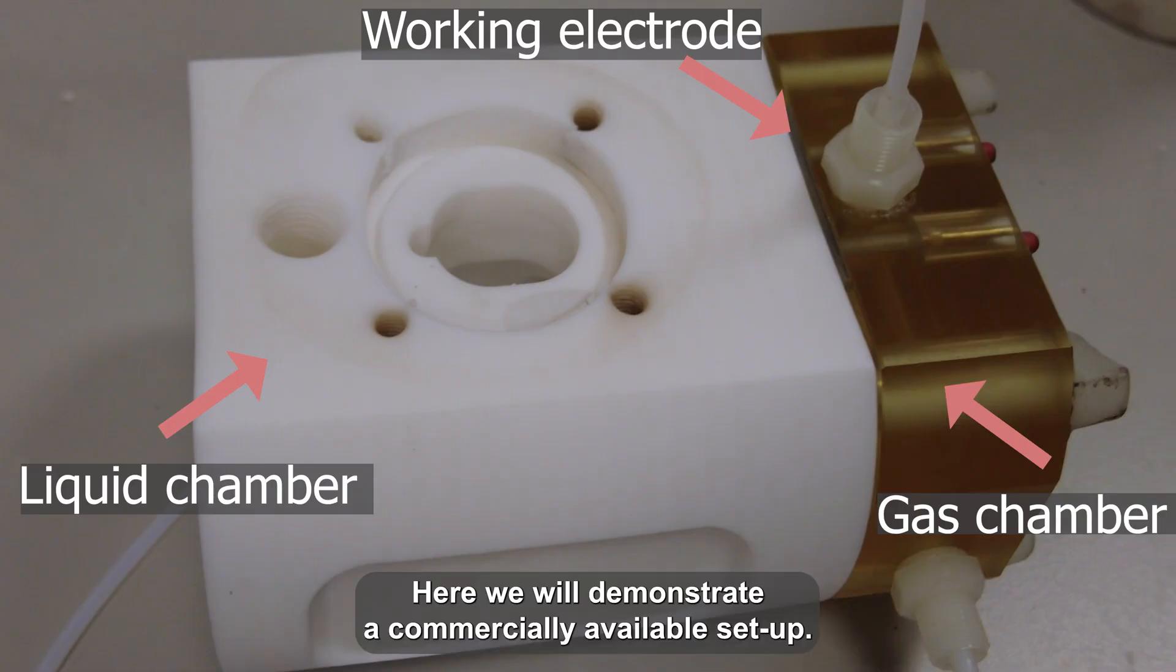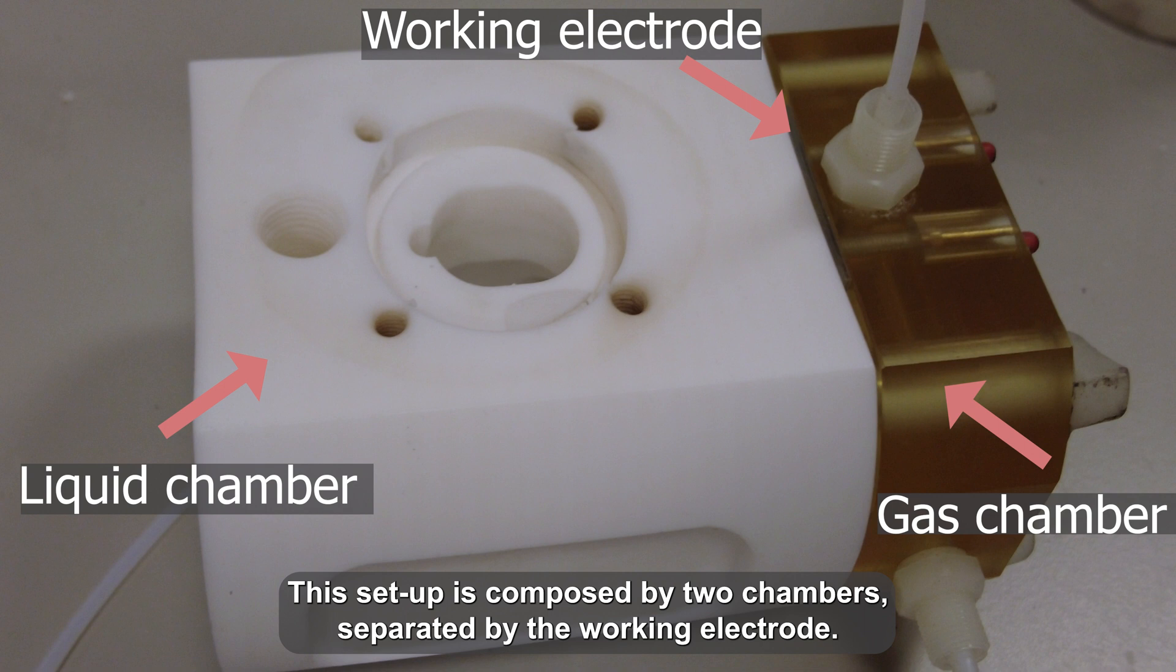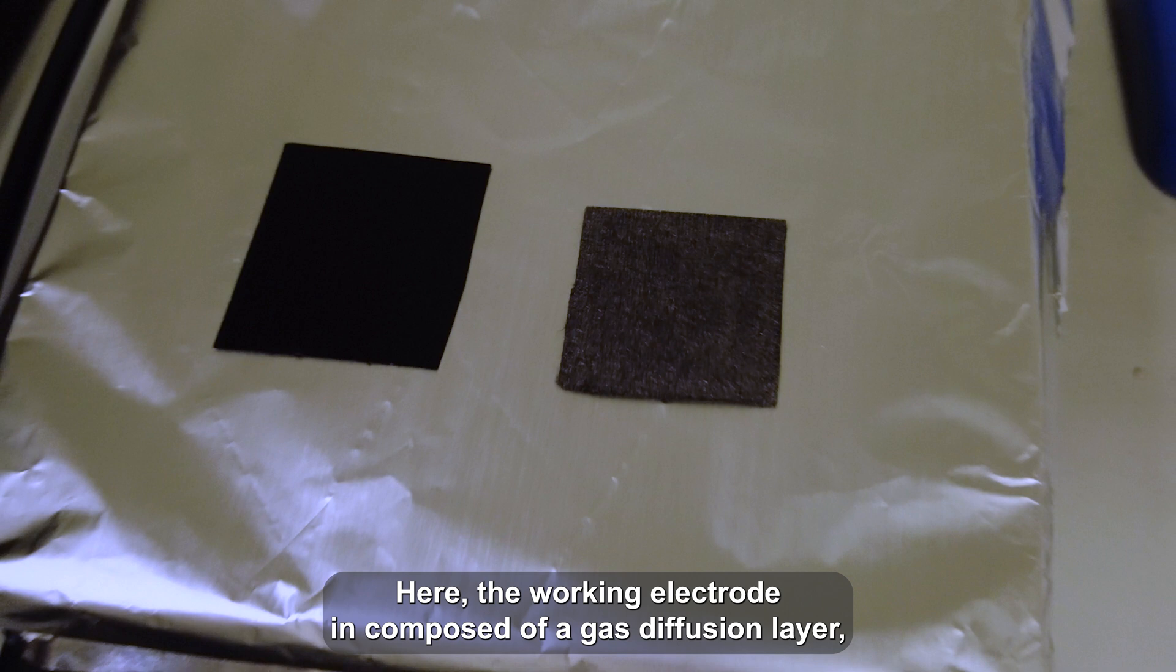Here we will demonstrate a commercially available setup. This setup is composed of two chambers separated by the working electrode. The working electrode is composed of a gas diffusion layer, generally carbon paper, where the catalyst is deposited.